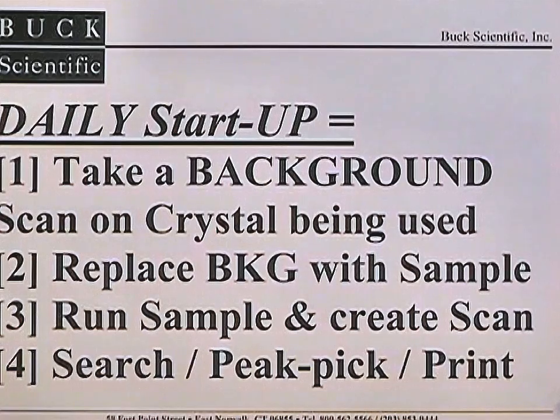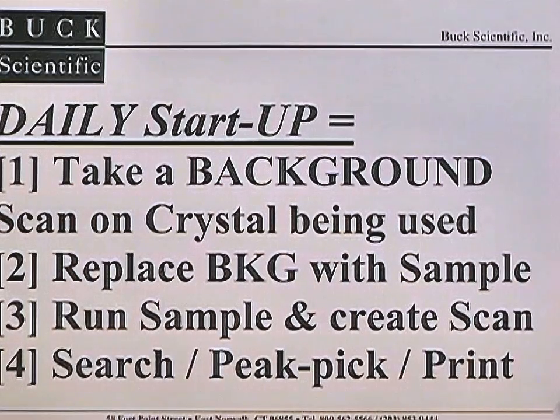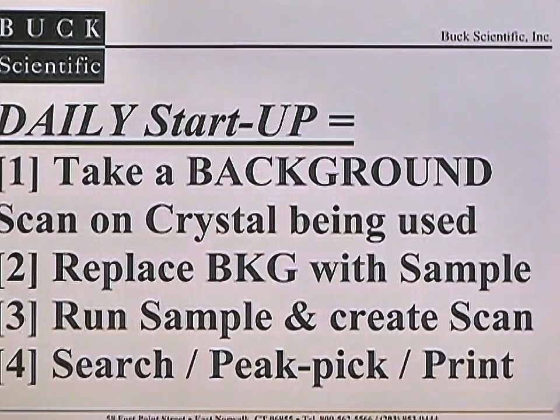As with all spectroscopy software, it is necessary to start the day with a fresh background or reference spectrum on either an open path, or the sodium chloride, or ATR crystal that will be used for your samples. Replace the background with the sample material, scan the sample, and create your percent T or absorbance spectrum.